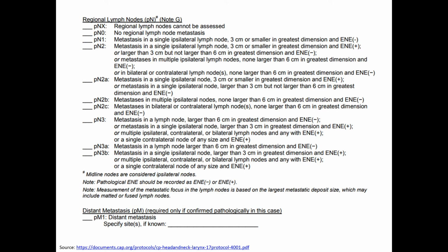Again, every single case, I have this thing plastered next to my microscope, and I double check every case because the worst thing I can do is stage it incorrectly. From a grossing perspective, generally I don't have issues with lymph node dissections. Most of the time, it's pretty straightforward. That's a relief to hear.